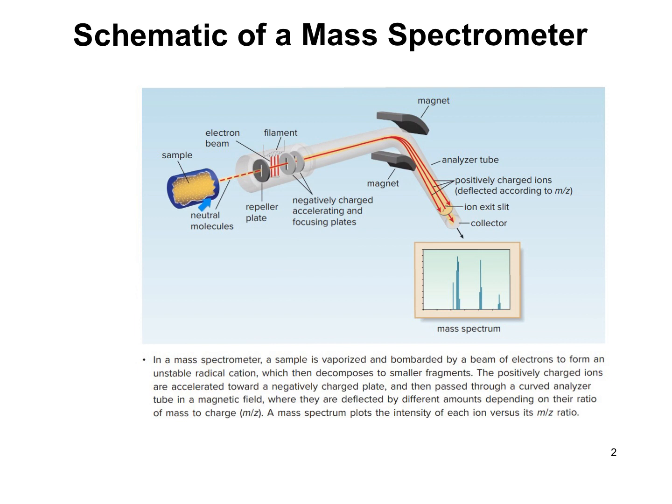So if it's in a liquid form, it's turned to a vapor, and then it's ionized by bombardment with a beam of high energy electrons. The electron beam is traveling at a high energy, something along the lines of 70 electron volts, and it ionizes the molecules, causing them to eject an electron.